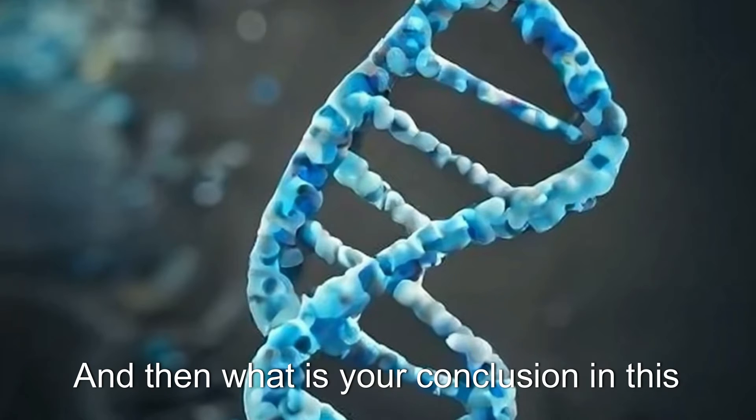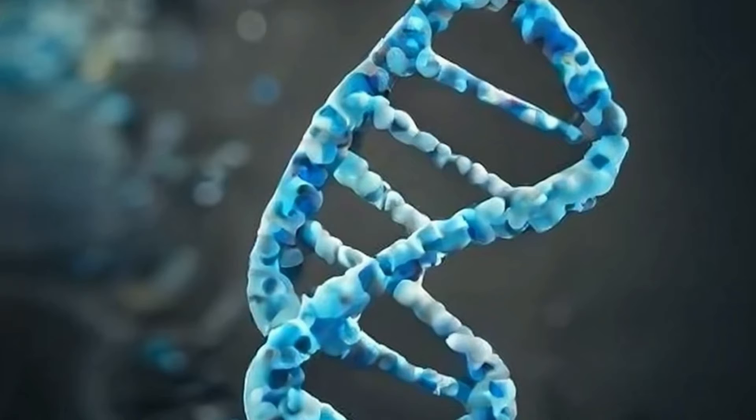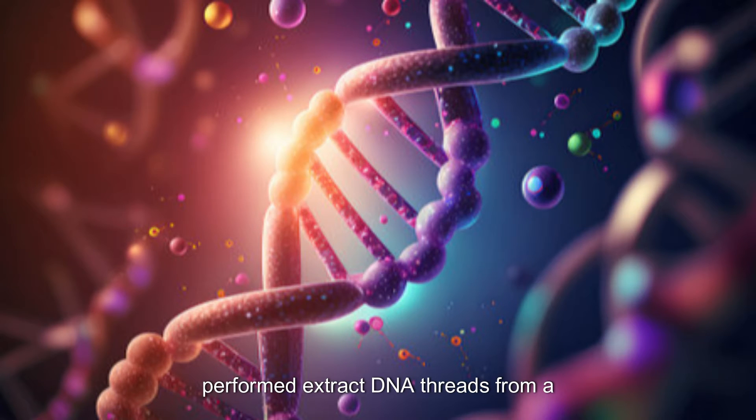And then what is your conclusion in this regard? So if you are to write a report, don't forget to write an investigative question. And then the aim, to investigate whether the process can be performed to extract DNA threads from a banana, depending on what you are using.